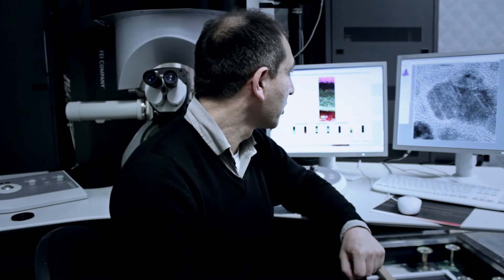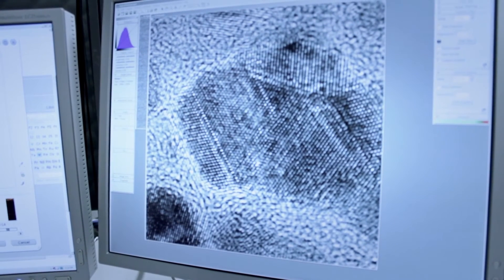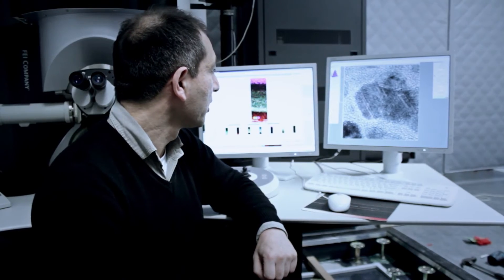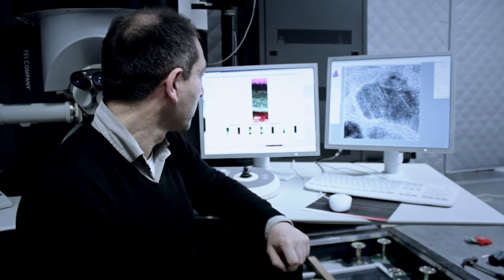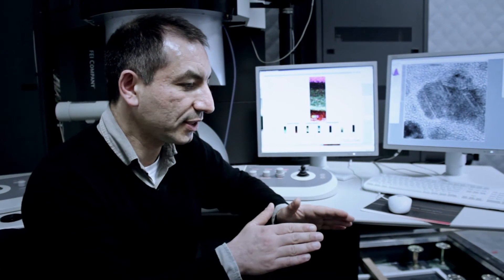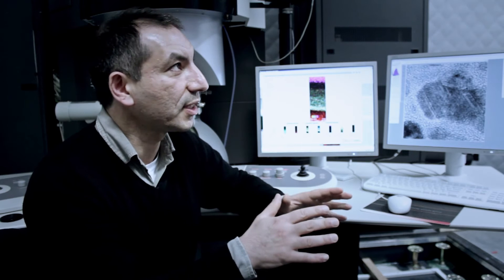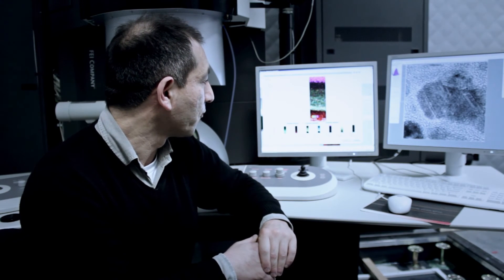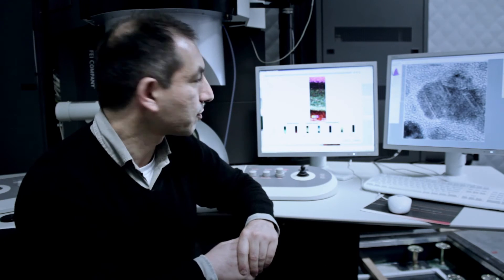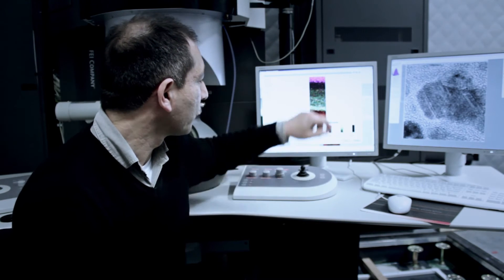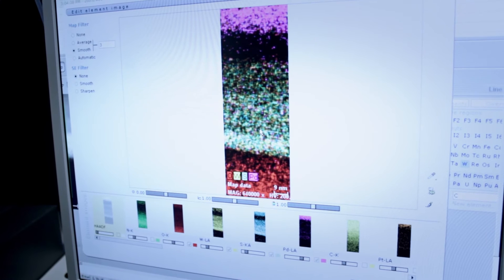So you can see here, this is gold lattice images that you can see of the gold atoms. And we also have a four coordinate EDS detector which allows us to get really high capture angle for chemical analysis, so a very high amount of counts we can get. So we can get really high resolution chemical analysis into atomic resolution.